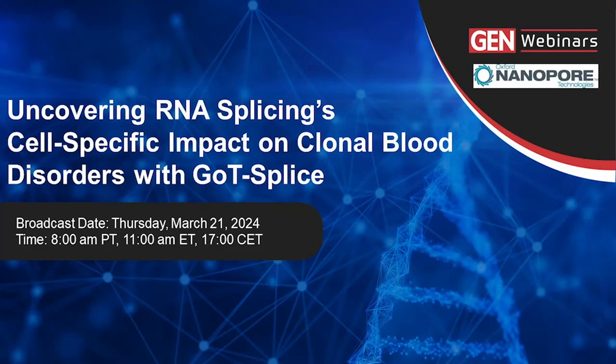In this webinar, Dr. Cortés López will present a novel approach, GoT-Splice, developed by the Landau Lab at the New York Genome Center in collaboration with the Abdel-Wahab Lab at Memorial Sloan Kettering. This method integrates genotyping of transcriptomes with Oxford Nanopore long-read single-cell transcriptome profiling and proteogenomics. GoT-Splice comprehensively profiles transcriptomes, surface proteins, somatic mutations, and full-length RNA splicing at single-cell resolution.